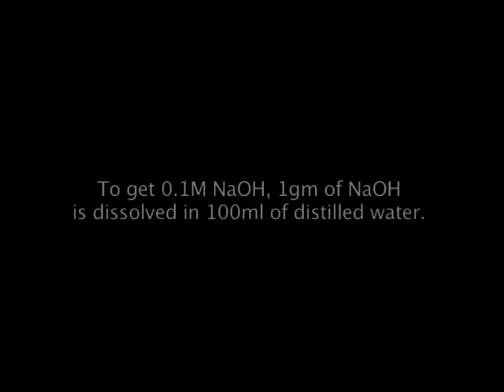The concentration of sodium hydroxide is 0.1 molarity. It is called a standard solution. Now we are going to find the concentration of HCl. To get 0.1 molarity NaOH, 1 gram of NaOH is dissolved in 100 ml of distilled water.